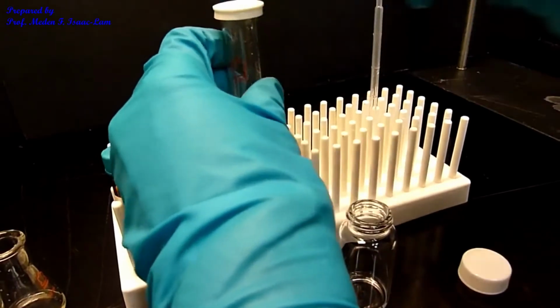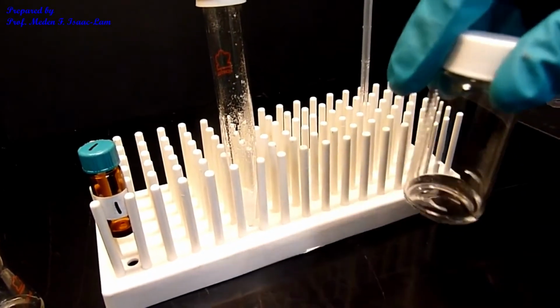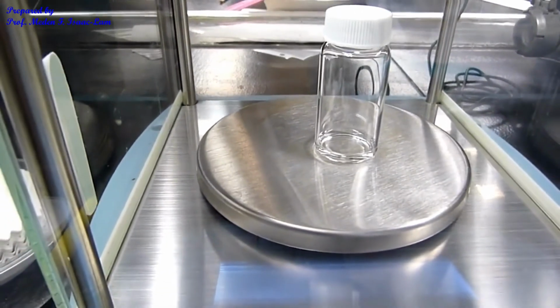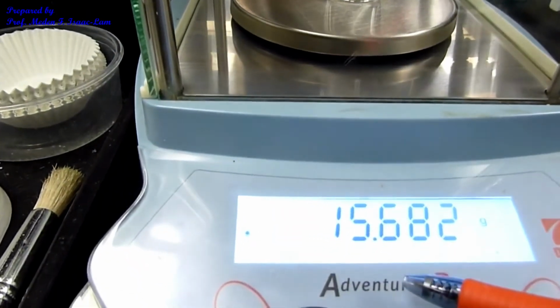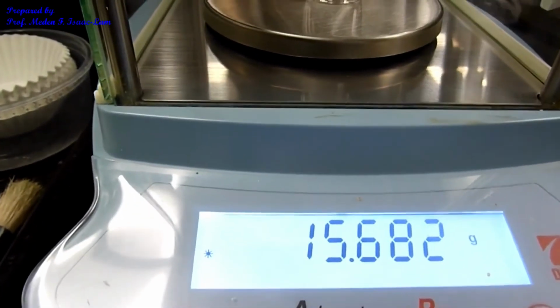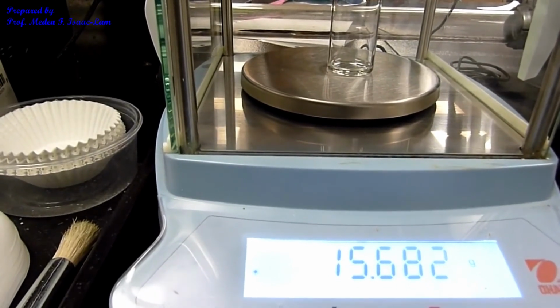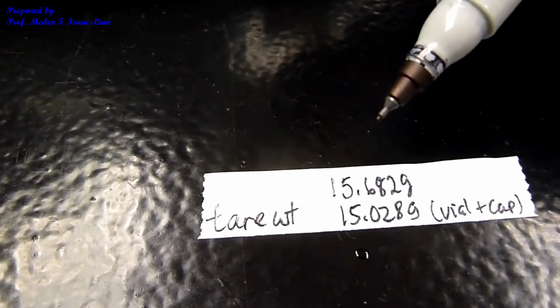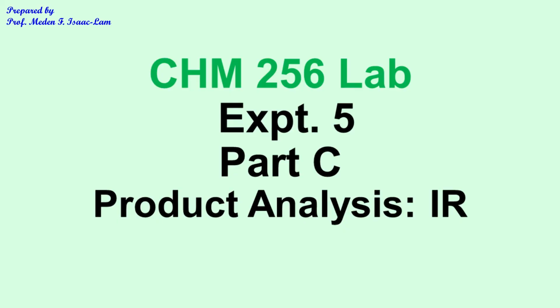That's the most I can get out of that tube, and we're now going to weigh this. We are now weighing the vial with the liquid ester, and right now the weight is 15.682 grams. You're going to subtract the weight of the vial and the cap from this weight. So the weight now is 15.682 grams, and the weight of the vial and the cap was 15.028 grams. So you get the weight of the ester.